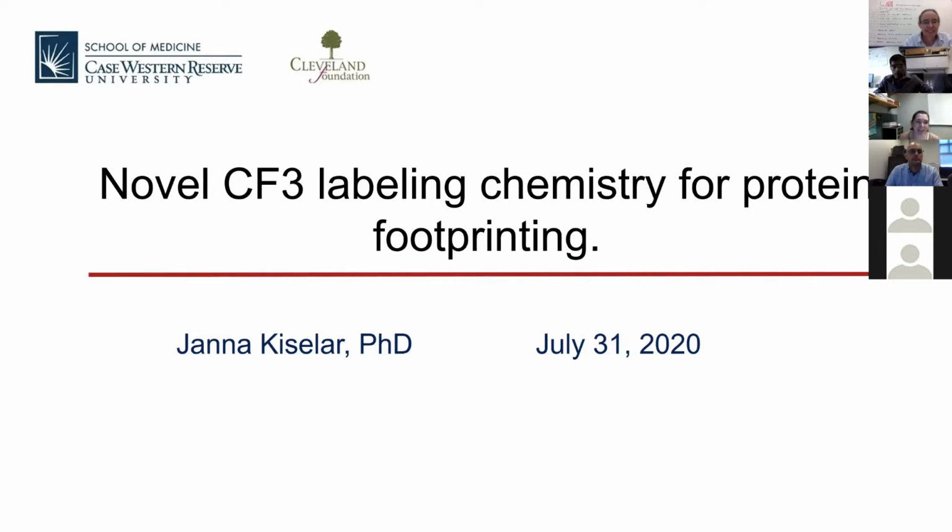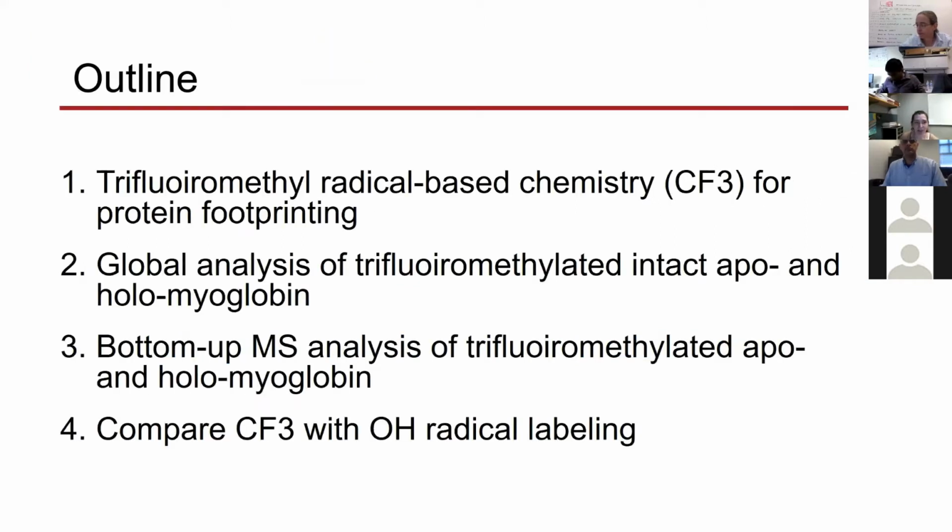Hi, everyone. So I would like to share with you today a new technique which we developed in collaboration with Michael Gross, because he was a pioneer actually, but we are developing it and adapting it to the synchrotron platform. Just a short outline: I'm going to talk today a little bit about the basics of trifluoromethyl radical chemistry, which we call CF3, for protein footprinting.